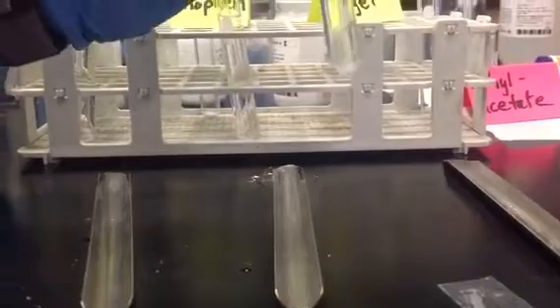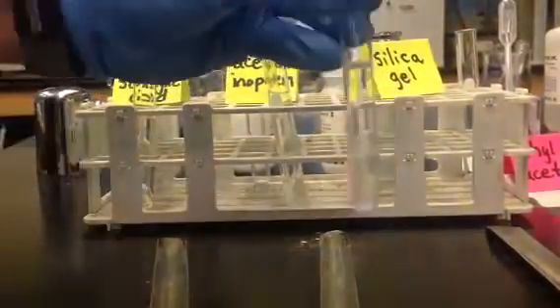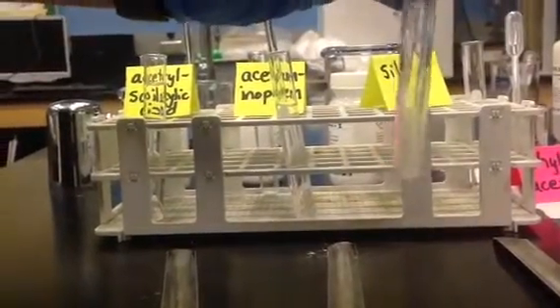And no, so the two layers, you can see the boundary between the two layers, and the silica gel is still at the bottom and it's not dissolving.